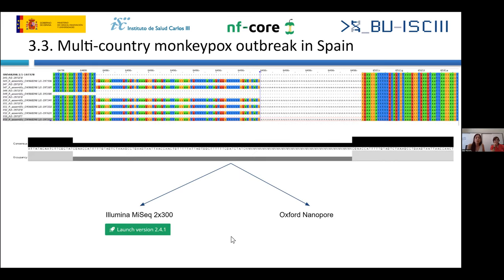Also, the monkeypox genome has short tandem repeats, and we were trying to discover if this approach was able to obtain the exact number of short repeats in our samples. We found that in the de novo assembly approach, when the short repeats were inside different contigs, the assembler introduces Ns in between the contigs, so we couldn't reconstruct the real short repeat scaffold. In the mapping approach, we saw that we had enough coverage to cover the reference short repeats, but that we are limited to the number of STRs present in the reference.